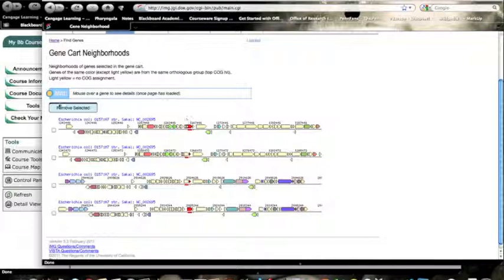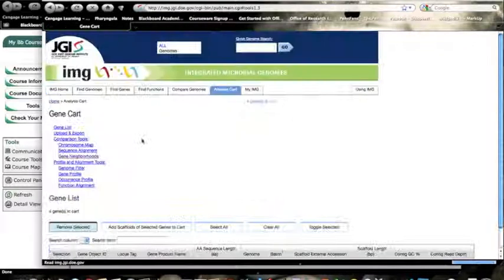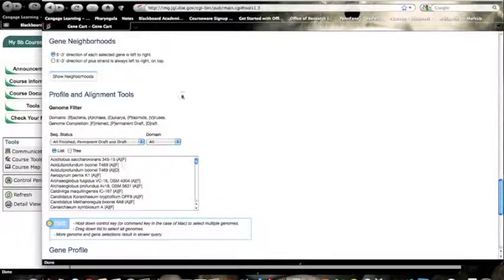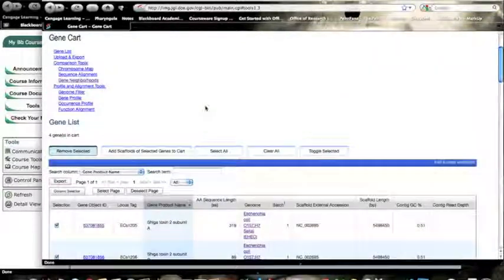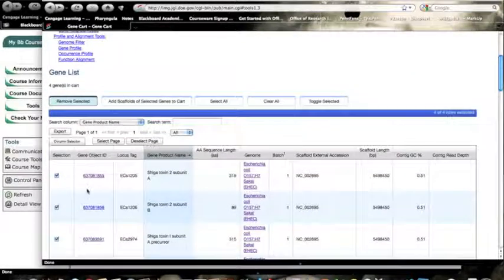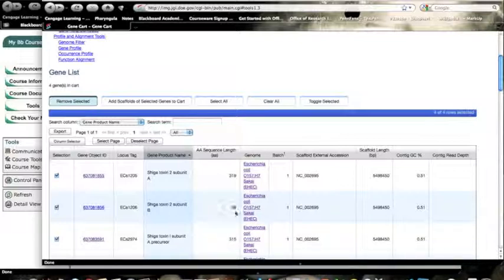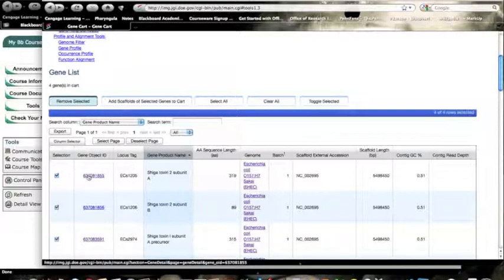So let's go back and take a look at the sequence of these. This has an amino acid sequence for the toxin A of 319. That makes sense because the one we saw in the neighborhood map was longer, where we have one that was much shorter, about a third the length for subunit B. So let's just look at the longer one.